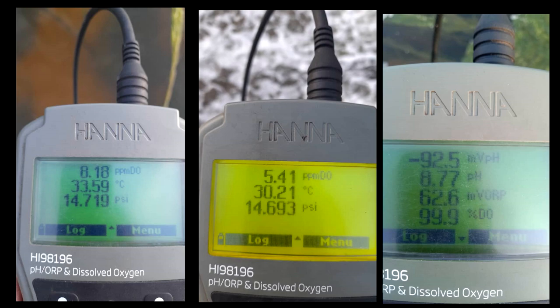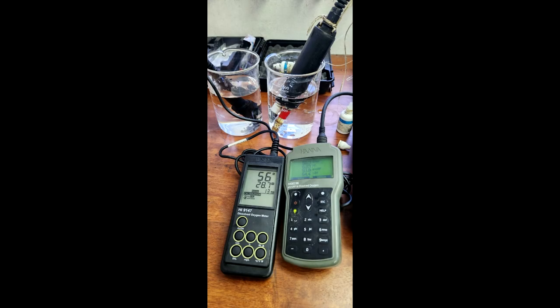The next model we actually bought was an entry level model, because we realized that some of the memory function, although it's really useful, it's not required in every scenario. So we bought another model for our indoor shrimp farm where we are manually recording down all of the dissolved oxygen values. It's actually the meter you see on the left. We compared it with our higher end model as well, and the results were actually very similar and repeatable.